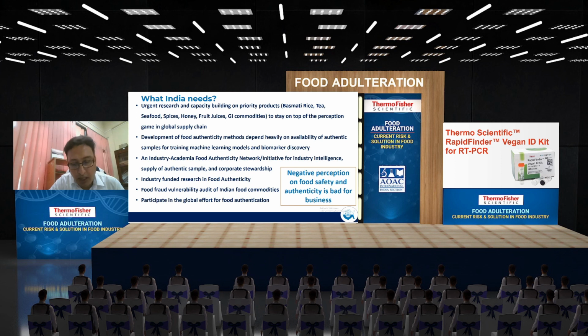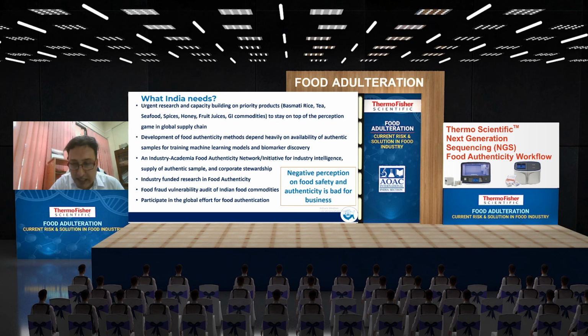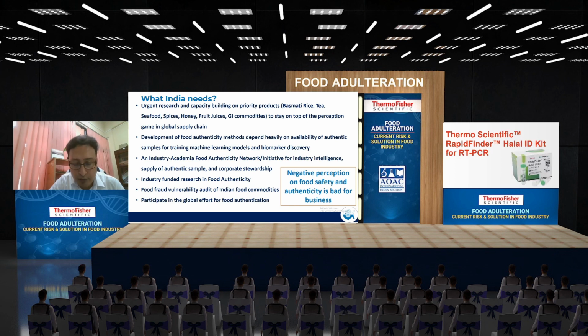So here we have vibrational spectroscopy, we have NMR, we have IRMS, and we have LC-MS, LC-HRMS. Different techniques are useful for different purposes. Vibrational spectroscopy is a rapid method, can be used for screening a lot of food in the field.